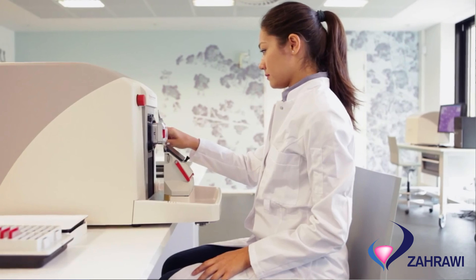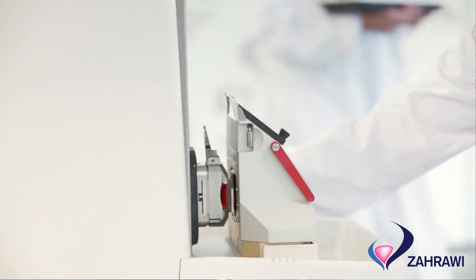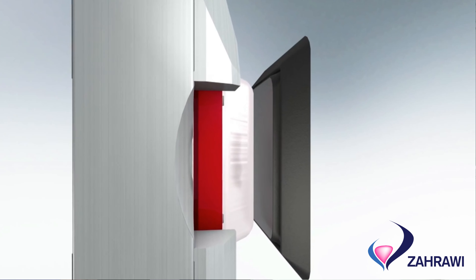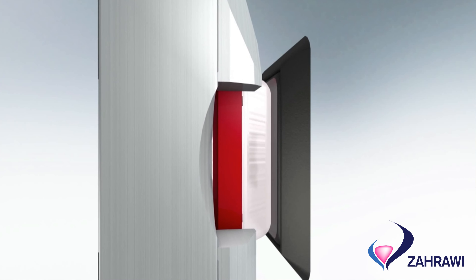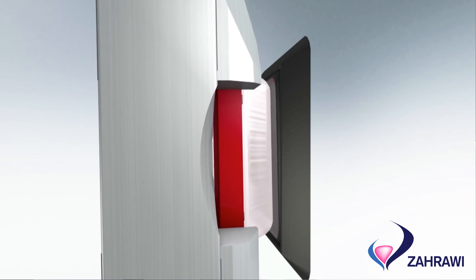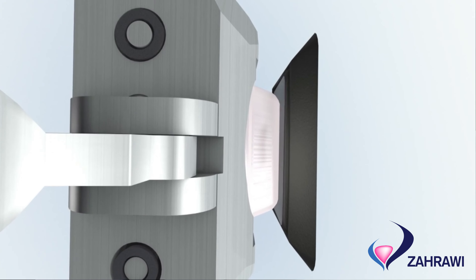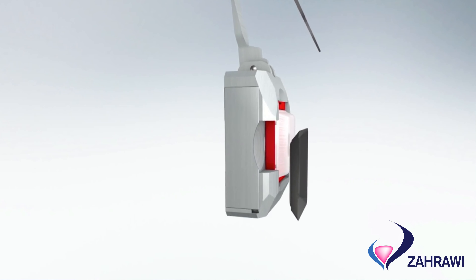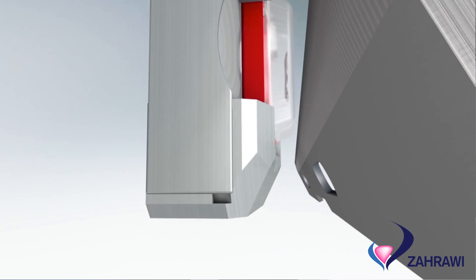There are a couple of key features that take it beyond there to help the pathology professionals. The first one is the auto-align technology, which allows us to align the block at the back of the system to make sure that the block goes down on the knife blade holder correctly.